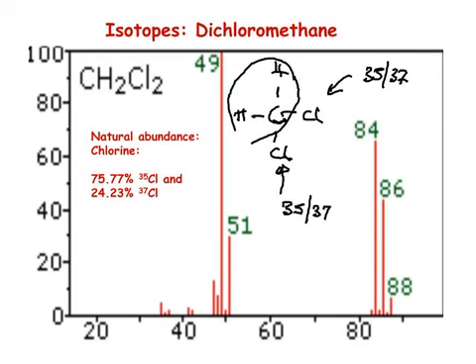Now let's see what this bit adds up to in terms of its relative molecular mass. 2 hydrogens, 2, and a carbon 12. So we're going to have 14 plus what comes from the 2 chlorines. Now, you see the possibilities with 2 chlorines. Let's say we've got 2 35s, that's going to give us a 70. That's referring to the 2 chlorines here and here.